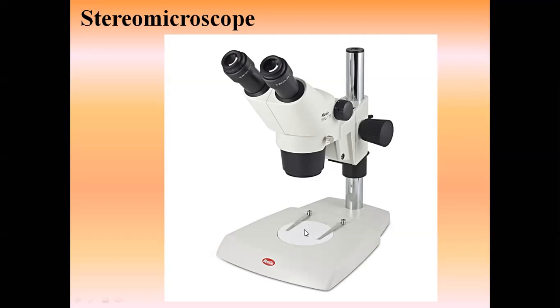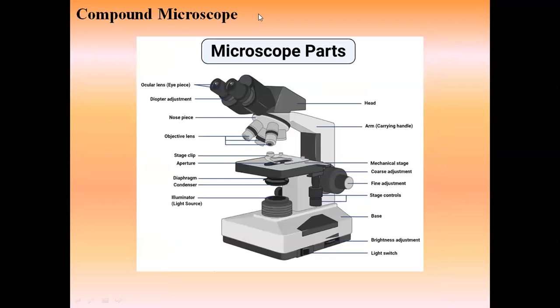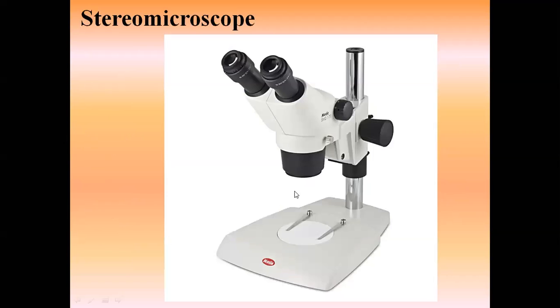and your specimen. The area between your stage and this objective lens is always more as compared to the compound microscope. When you see the area between the objective lens and the stage in a compound microscope, it is very small, and in this the area is large. And that too, the moving stage is not there, and the option of adjusting the objective lenses is not there.